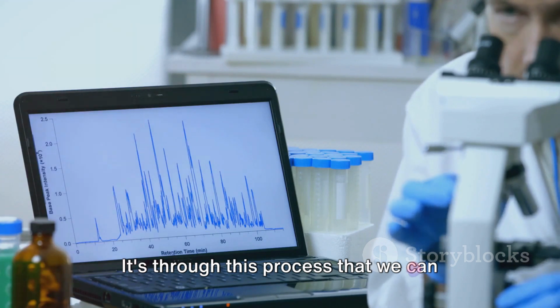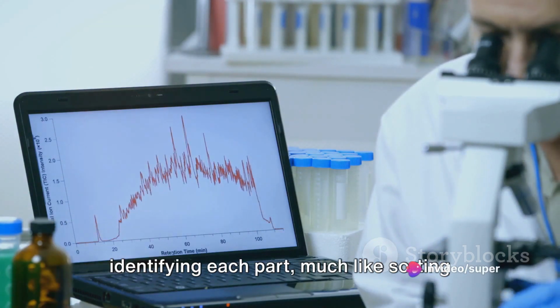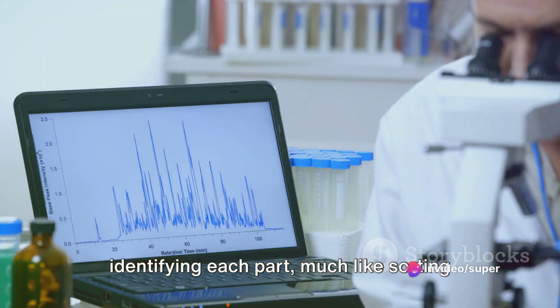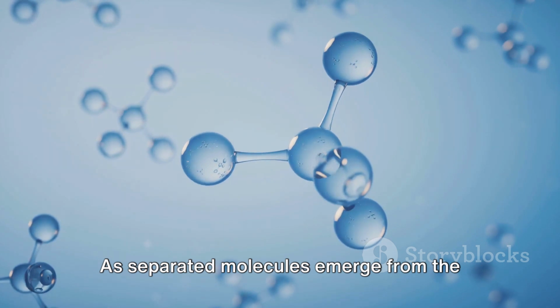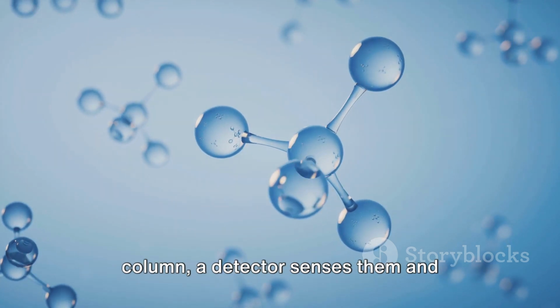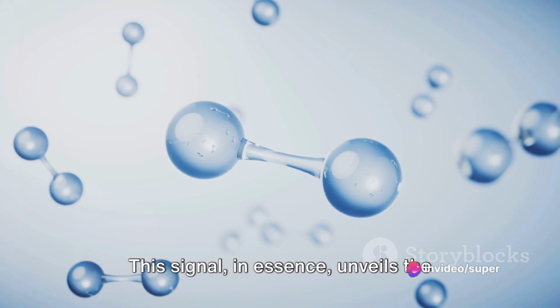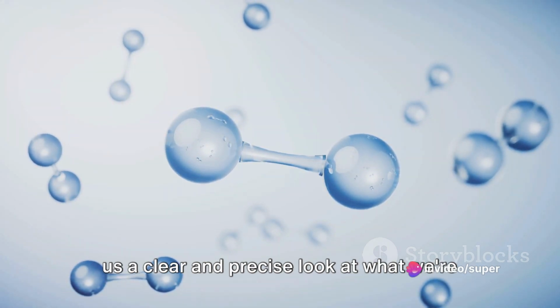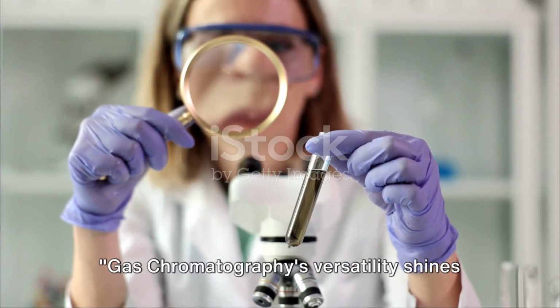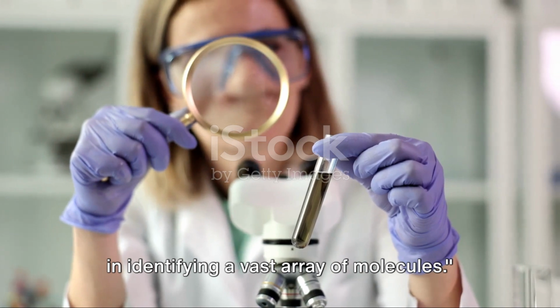It's through this process that we can analyze complex mixtures, separating and identifying each part, much like sorting through a drawer of trinkets. As separated molecules emerge from the column, a detector senses them and generates a signal. This signal, in essence, unveils the hidden components of our mixture, giving us a clear and precise look at what we're dealing with. Gas chromatography's versatility shines in identifying a vast array of molecules.